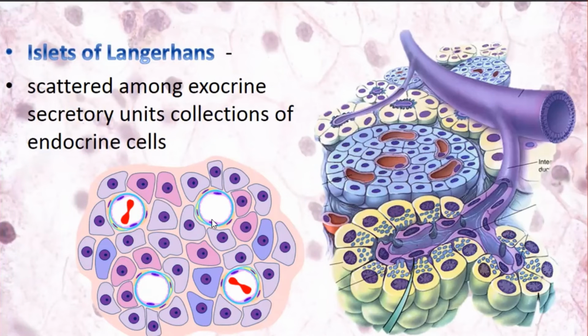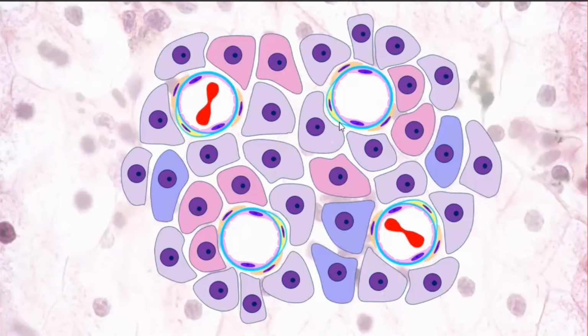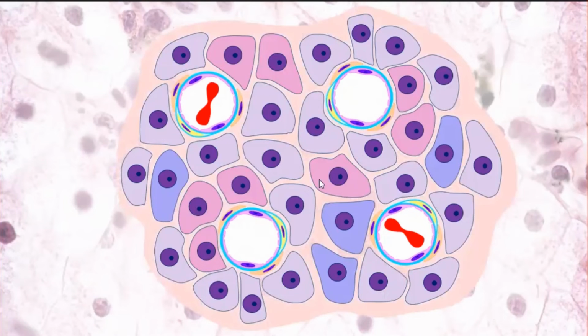And blood capillaries are of fenestrated type. They have high permeability. Here we can see endocrine cells. Also there are capillaries, fenestrated capillaries, and also there is connective tissue which fills the spaces between the cells. And we can find here some cells are acidophilic. They are pink in their staining. Also we have here basophilic cells and pale cells which aren't well stained.